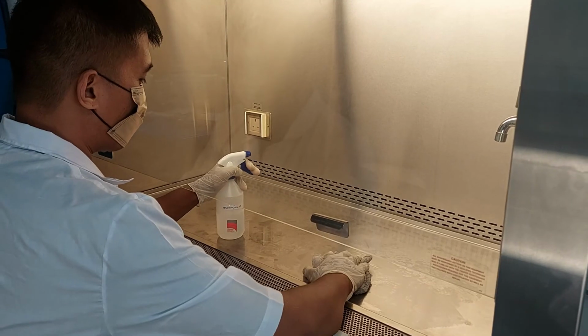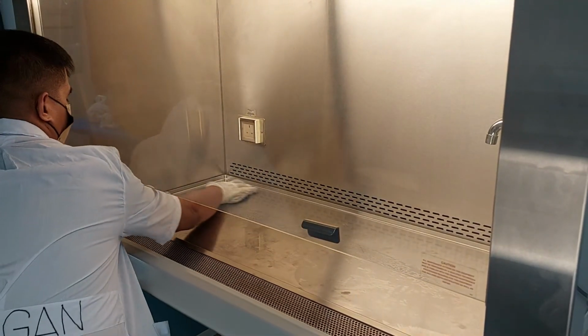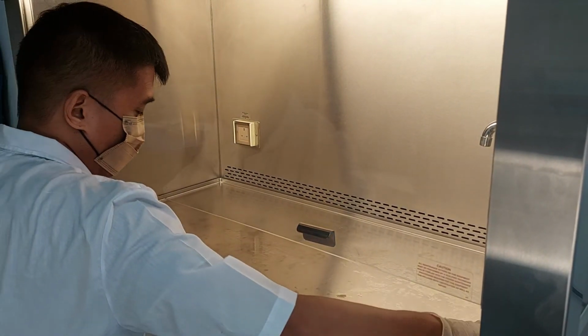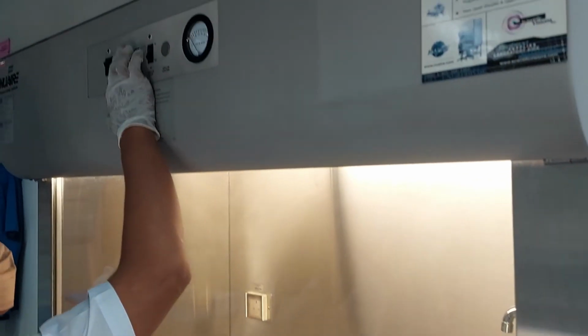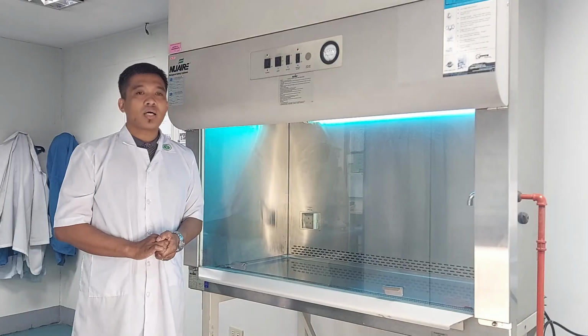After the work is complete, allow the unit to purge for 5 minutes, then wipe it down again with a suitable disinfectant. It is important that you turn off the bacticinerator before the disinfection process. Turn on the UV light for at least 5 to 10 minutes. Shut down the unit.